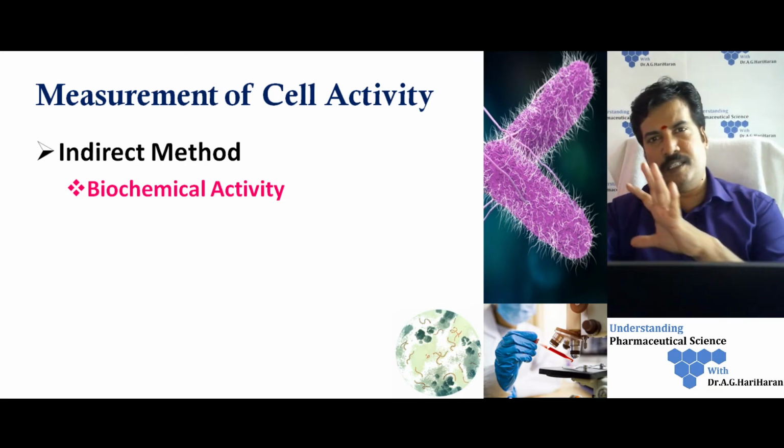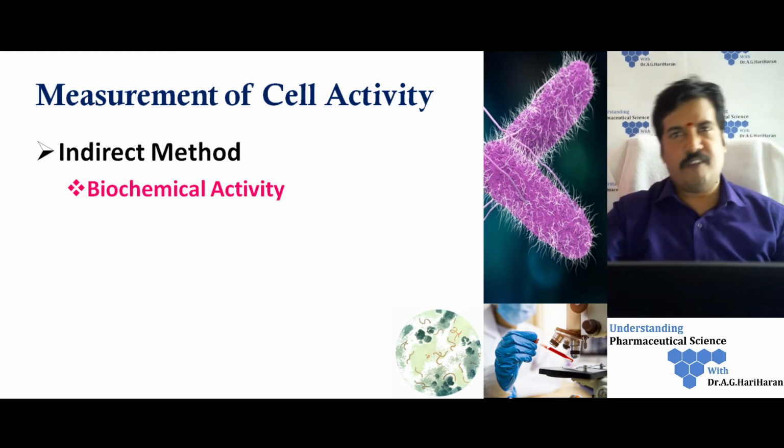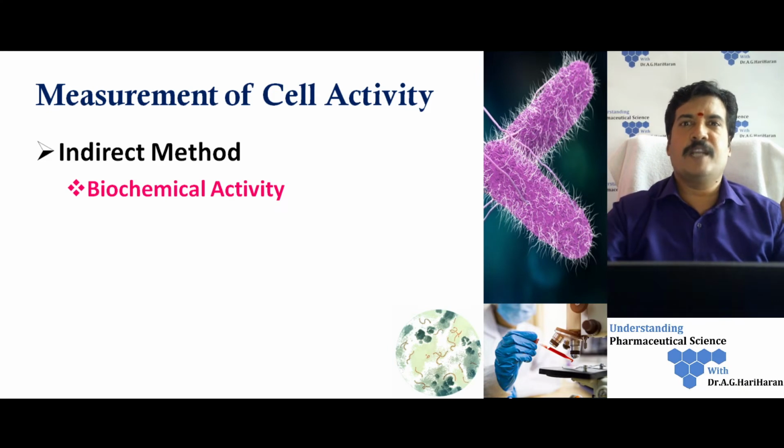So these are the brief outline of various methods available for the enumeration of microorganisms, or more commonly, for the enumeration of bacteria and fungi. Let us understand one of the major techniques, that is the Coulter counter.